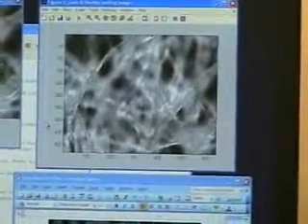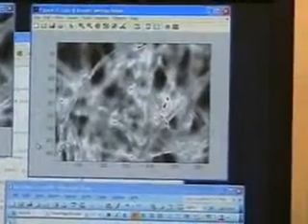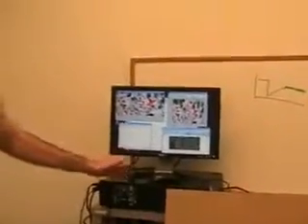And as I move far enough down, you'll see that I start picking up some red here. And if I come all the way down, I can turn my shutter to the max. You'll notice here it took a while to update. Sometimes if you click and you lose the crosshairs, you actually need to wait for the software to update. If you keep clicking, you'll just crash the software and have to restart it. Now I have my shutter at 3196. I've got a fair amount of saturation, and that's fine.